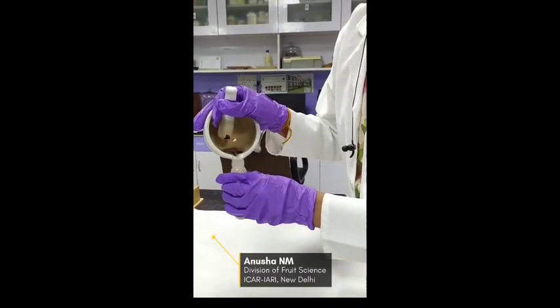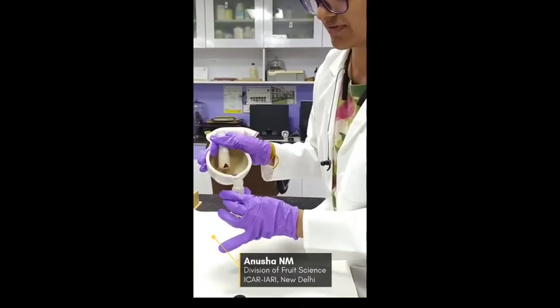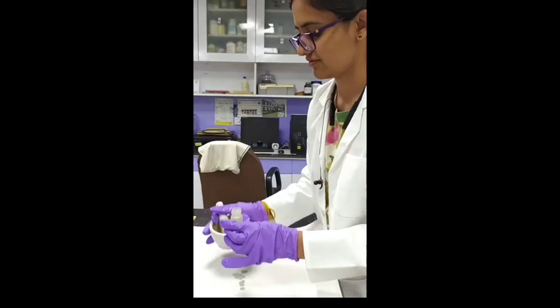Then we pour this mixture obtained by crushing grapes in ethanol into a centrifuge tube.